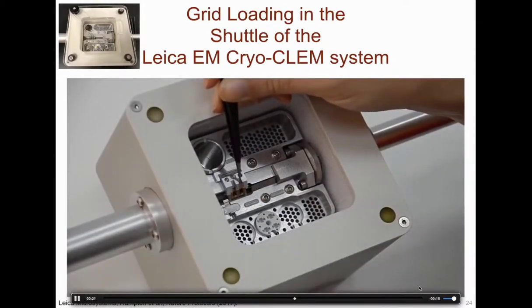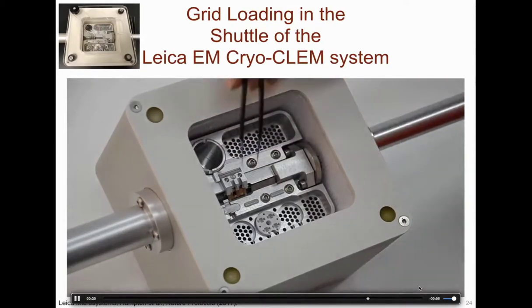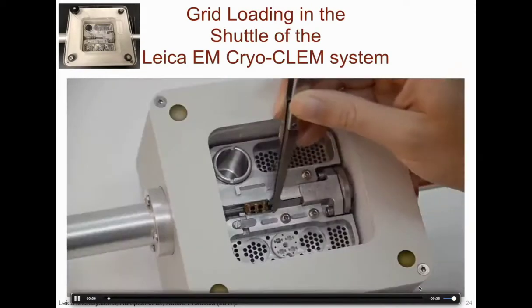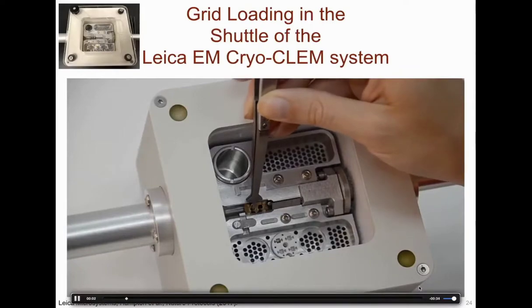The second option is to load the pre-clipped grids with standard tweezers. The final method is to load bare grids using regular tweezers and a grid alignment tool that is removed prior to transferring the grid cartridge to the Cryo-CLEM.